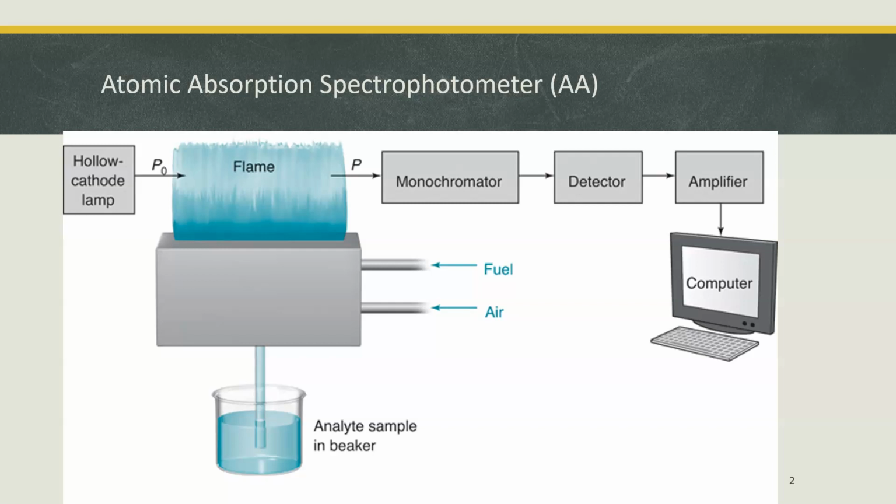Okay, so the pieces are all there, but they're in a different order, and instead of like a glass or a plastic cuvette, it's a fire. Okay. And this isn't really what it looks like. It's not floating, but this gives us the insides of what it looks like.